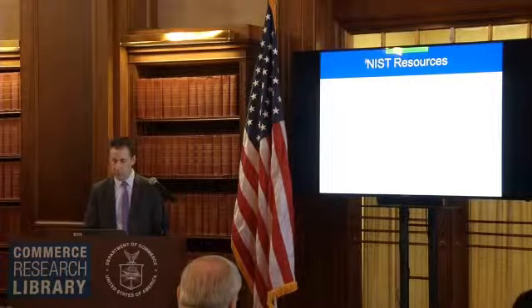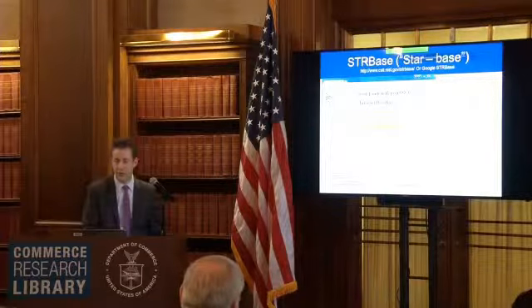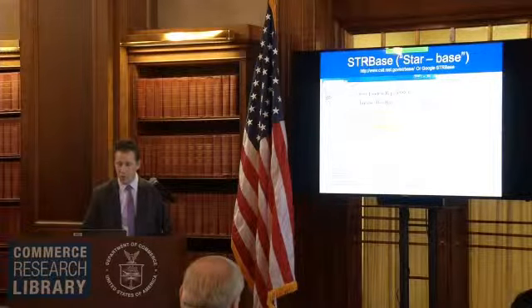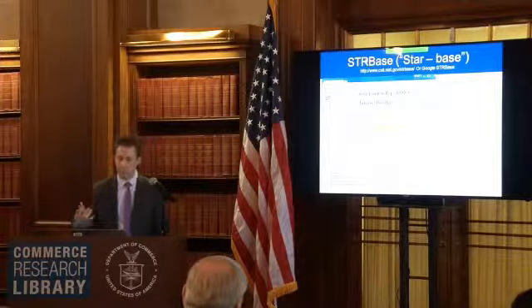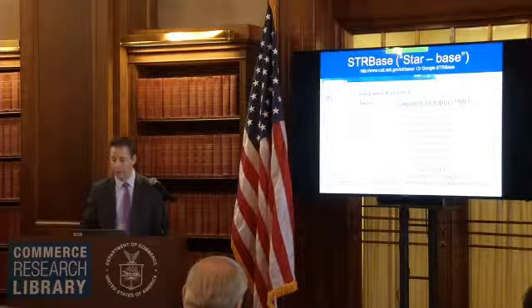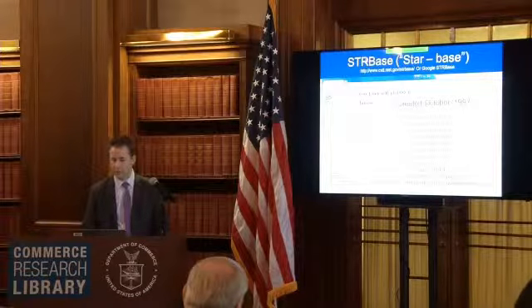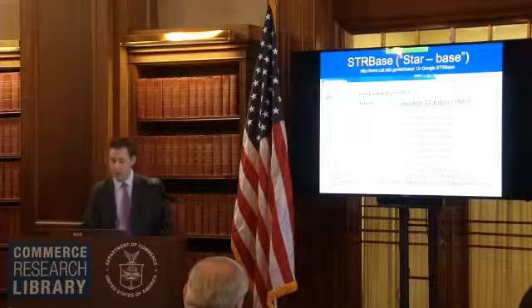And then the last couple of slides here are just some NIST resources. We have something called STRBase. The address is up here. You can go to this website. All the talks from our group and all our papers are up here. You can download those at any time, and there are lots of different PowerPoint presentations if you want more information on STR typing. So this was created in the late 1990s, so you can go up here and find all the information we've talked about for STRs, different software tools, the population data, sort of the foundational information.